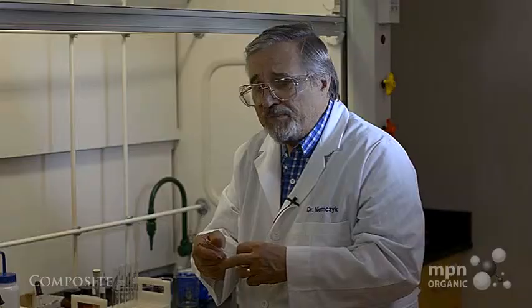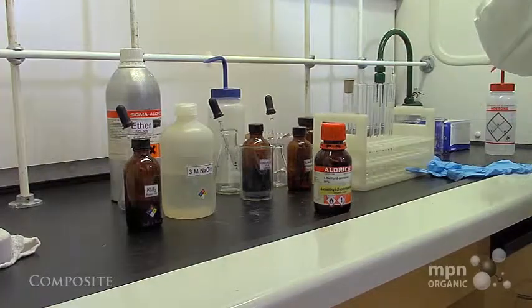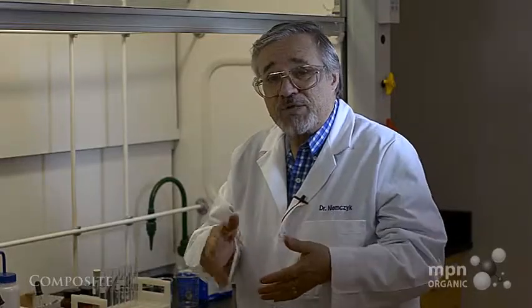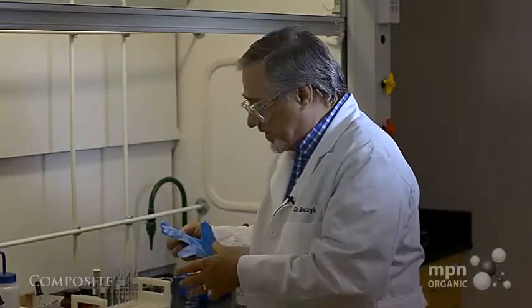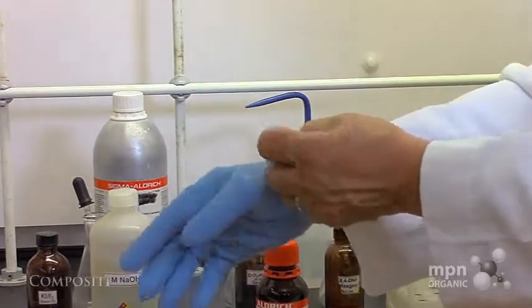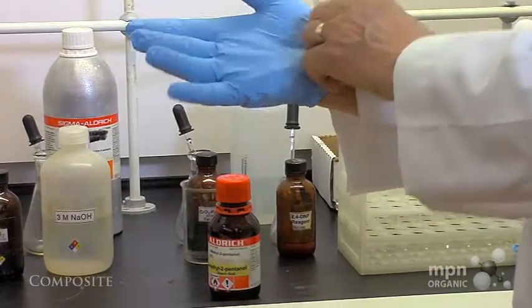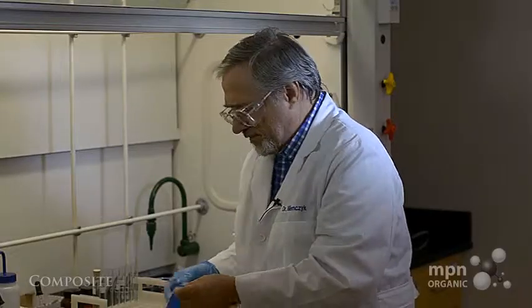Now remember what I said about using chromic acid. I put this right back here. I have got to wear gloves for this because chromic acid is labeled as a carcinogen, so we've got to take that seriously. So I'm going to put on some gloves here, and that will protect my hands.